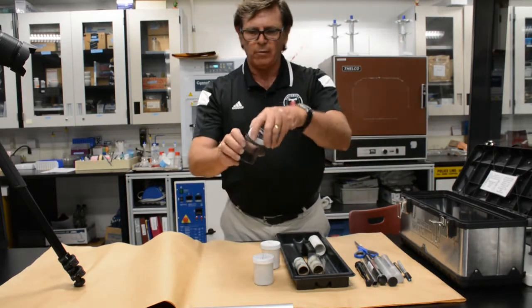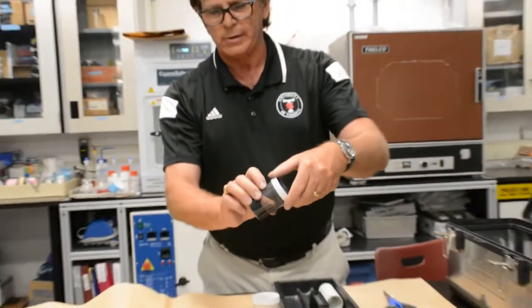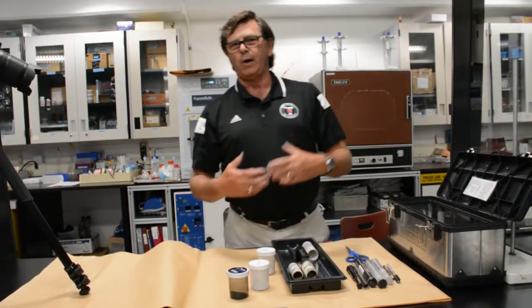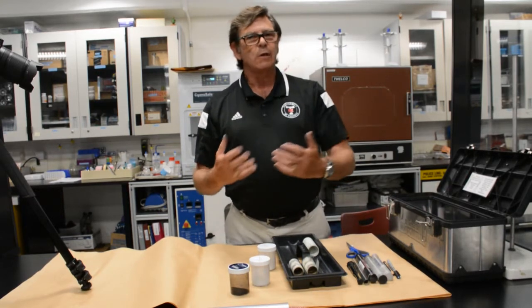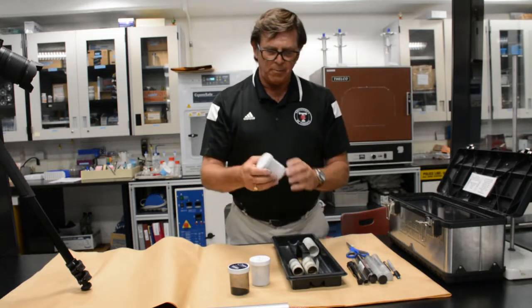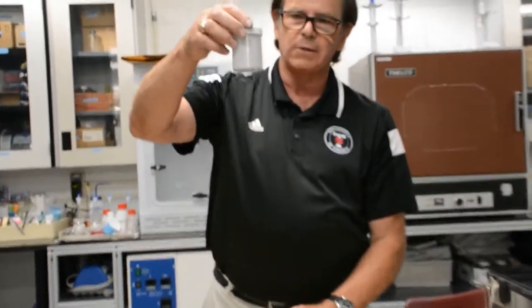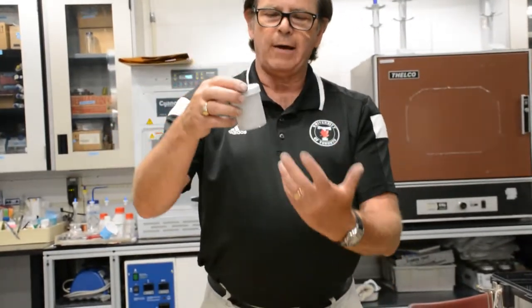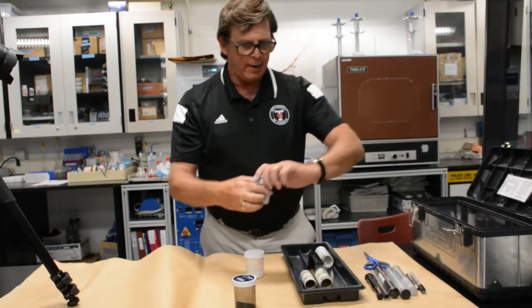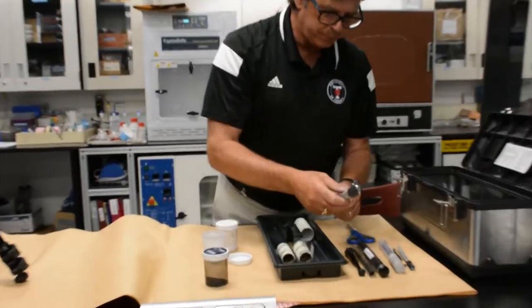You can see how very light and soft the powder is. It has an affinity to adhere to moisture within the fingerprint. So either sebaceous secretions, foreign material, or eccrine sweat, or other water deposits that might be part of the fingerprint impression. Now you'll notice with these jars that there's only a minimal quantity of powder in each one. The idea behind that is that it affords two purposes. One, it allows for the ability, and I'll just do a quick demonstration before we carry on here.